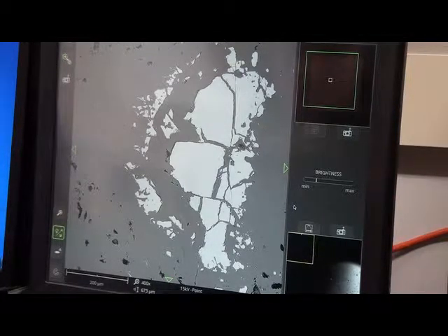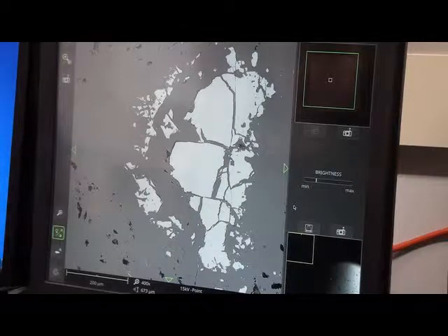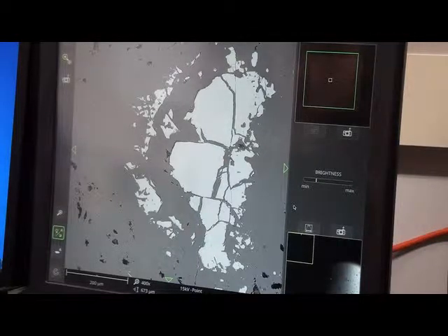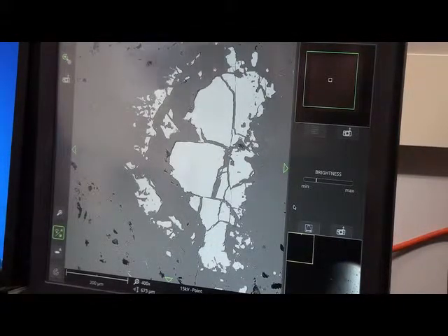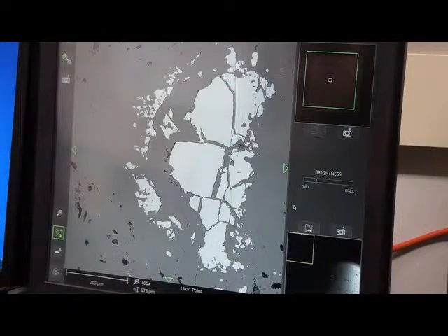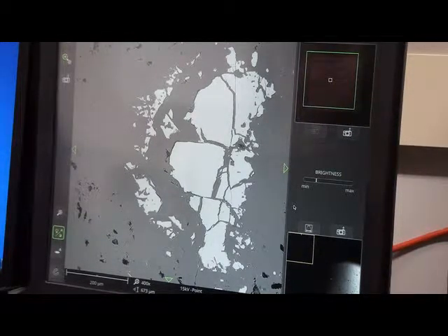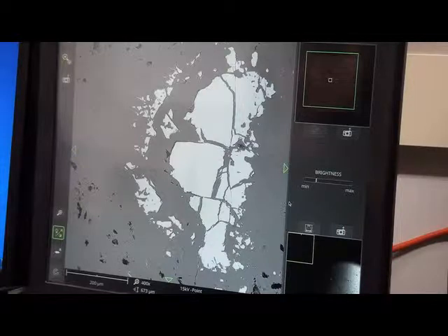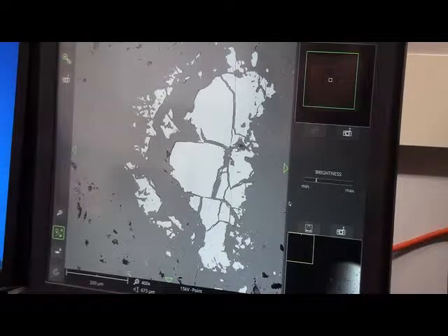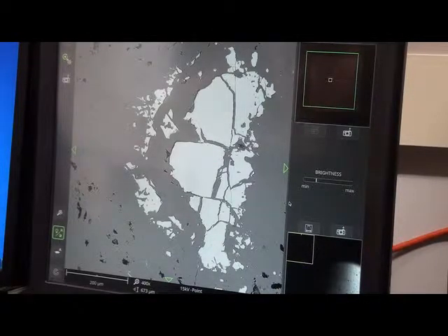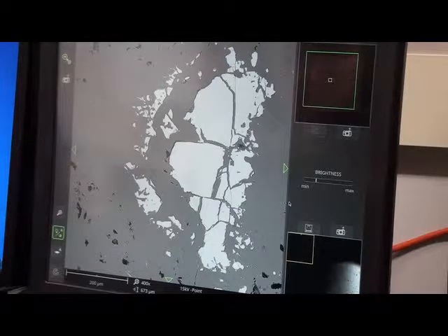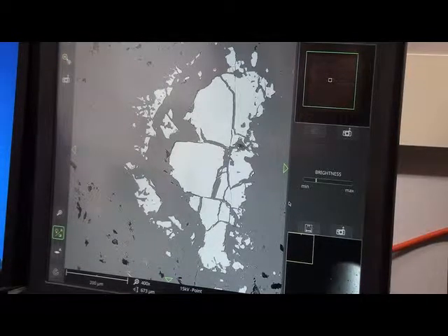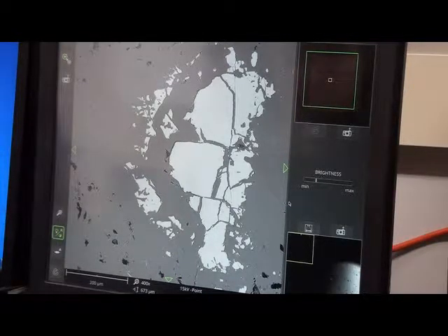This is a portion of the rock where you can see in the display a great deal of visual contrast. When you look at the sample in hand sample you can see these metallic, in many cases diamond shaped minerals. Here you can see it's not quite diamond shaped. We've allowed the brightness and contrast to automatically select and it's in focus.